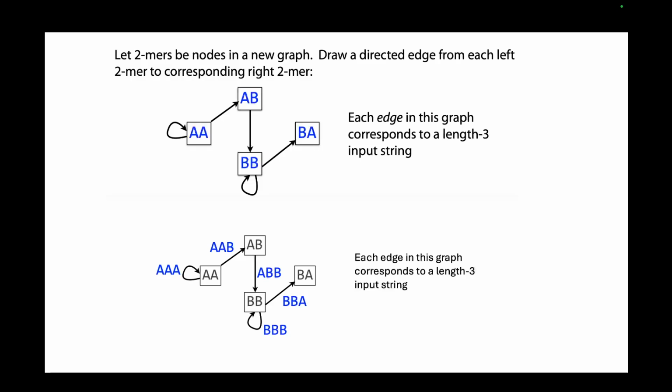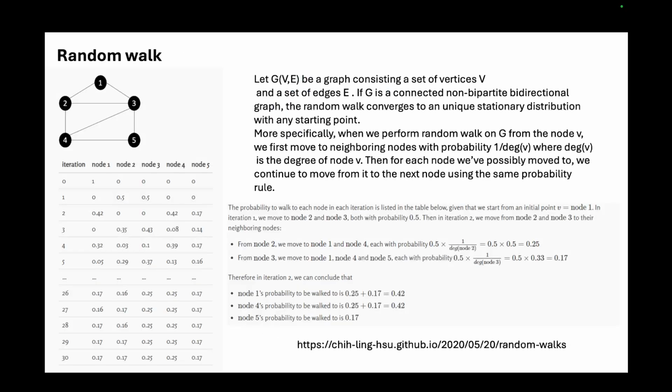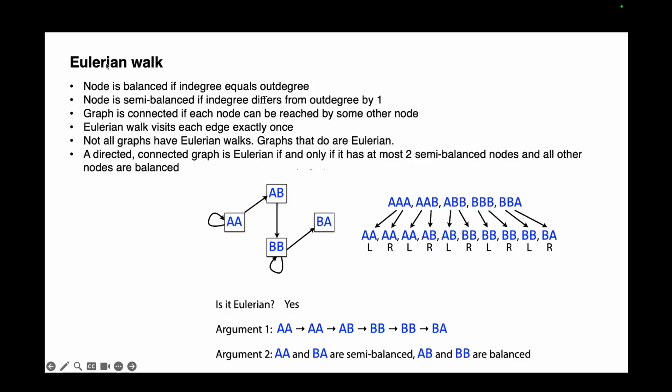For getting back the whole sequence, you need to traverse this whole overlap graph, or whatever graph you're making, because you have to move from here to here, next to next to next, adding up the suffixes and seeing what the whole sequence has become. So for this case, you need what is known as the Eulerian walk. The Eulerian walk is also a type of random walk.